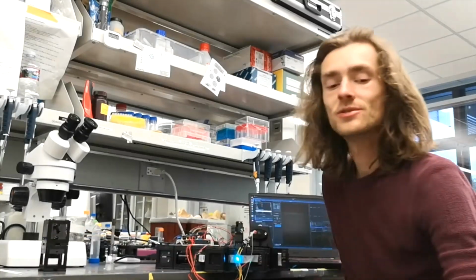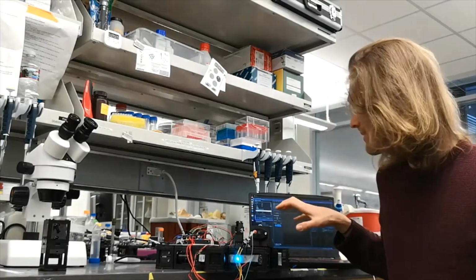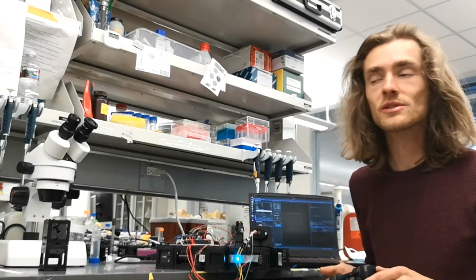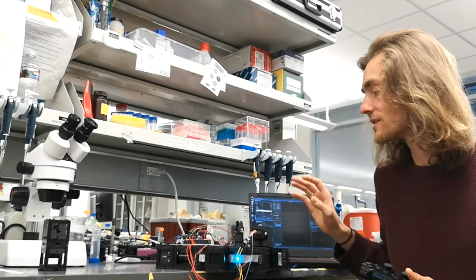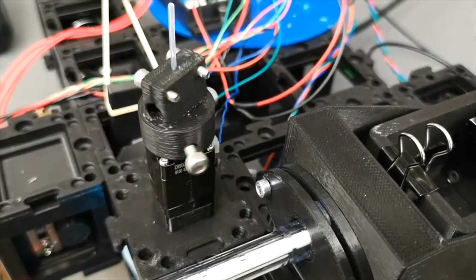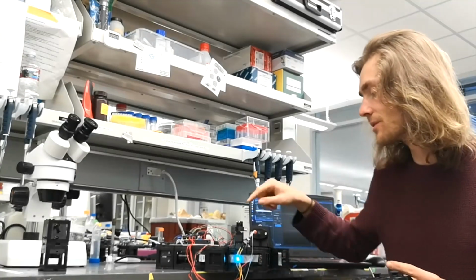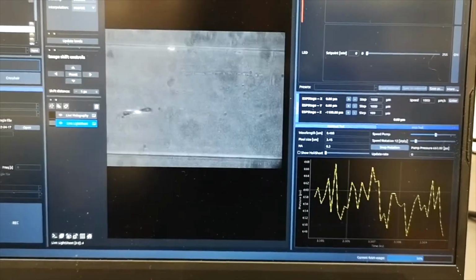What I'm going to do now is give you a little tour of how it works. There's a little syringe pump over here. I can control that through the PS3 controller that's connected to the ESP32 through Bluetooth, or I do that with the ImSwitch that's running in the background. We have a bunch of sensors connected and also actuators. For example, you can rotate the capillary and also move the syringe pump. When I move the syringe pump, the samples pump through the capillary that's then being rotated, and with this you can continuously measure plankton.